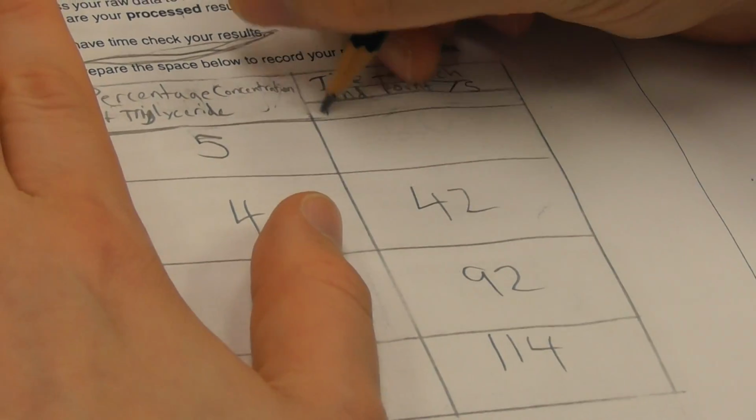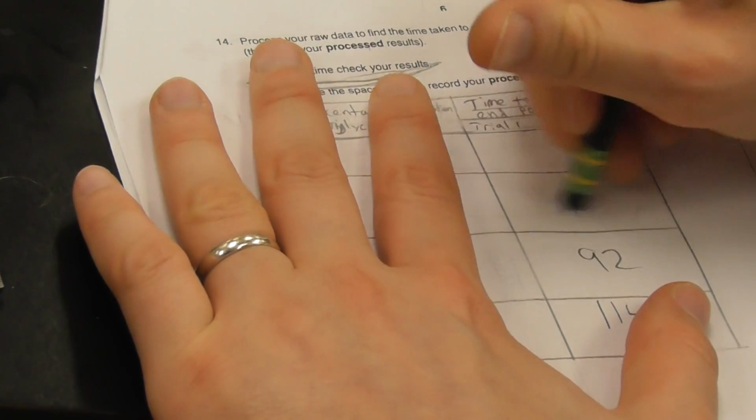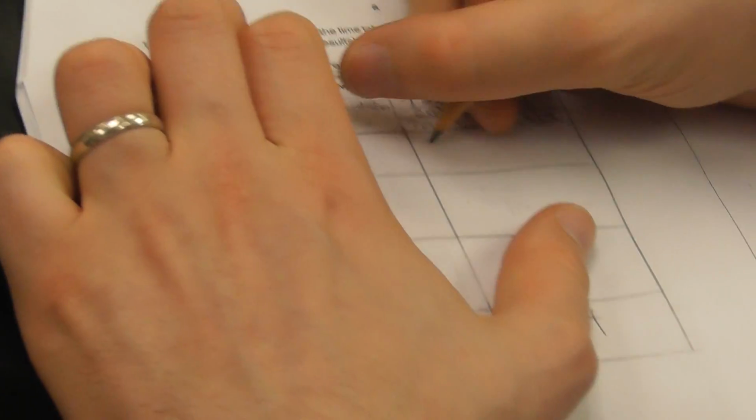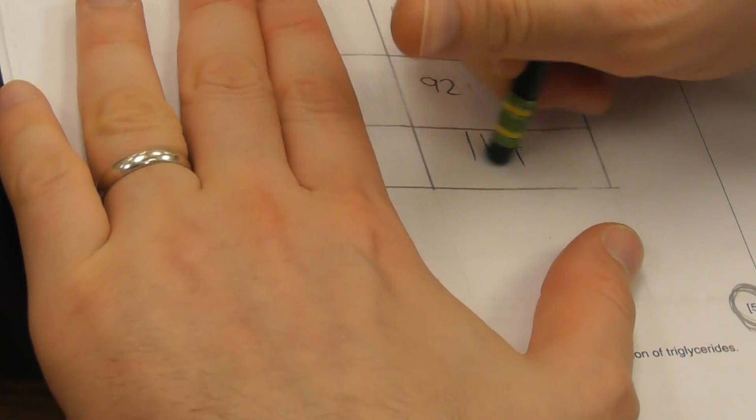All right. Trial 1, trial 2, 20, 42, 92, 114.